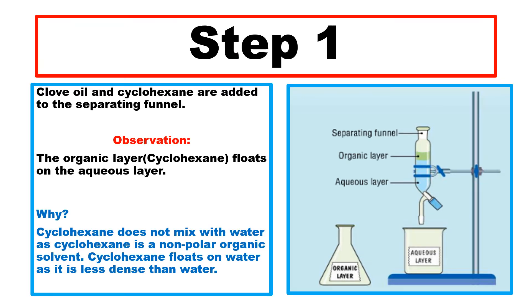Step one: the clove oil emulsion and cyclohexane are added to the separating funnel. The organic layer — cyclohexane — floats on top of the aqueous layer because cyclohexane does not mix with water, as it is non-polar, and it is also less dense than water.